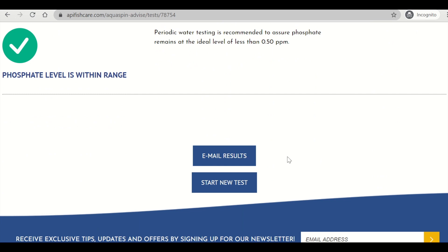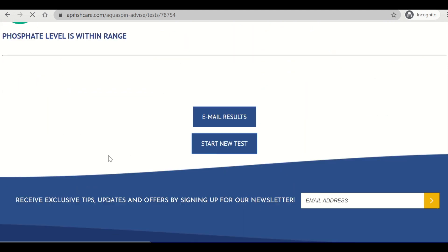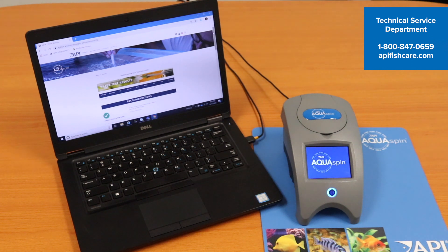You can then click email results. This will send an email of everything on this page, including the product recommendations and the results, to the customer. You can then hit start new test, which takes you back to your dashboard where you can start a new test with a customer or test another customer's water. And there you have it — AquaSpin testing results and API product recommendations have been provided to your customer within two minutes, leaving them more time for shopping and more time for your store associates to interact and sell. If you have any questions regarding your AquaSpin meter kit, please contact our API tech services team at 1-800-847-0659.